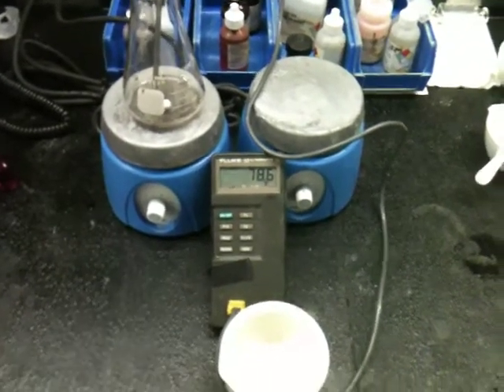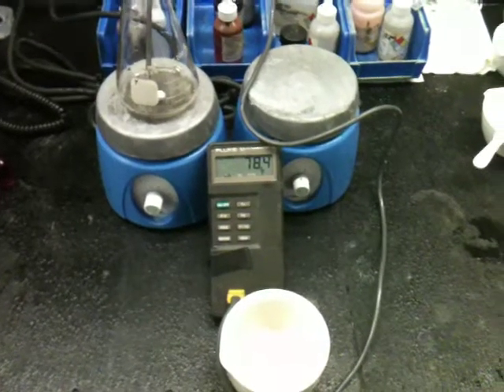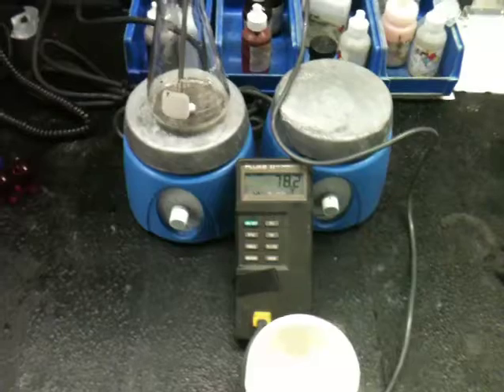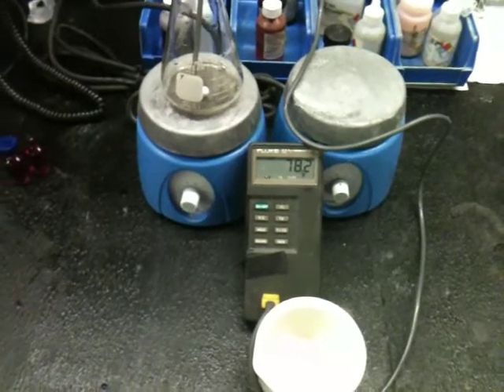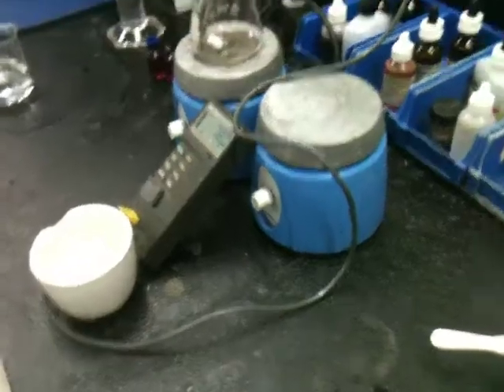Here I'm going to show you what mixing deionized water and sodium hydroxide will do and how quickly the temperature will rise. I'm going to initially add some deionized water, 100 milliliters.